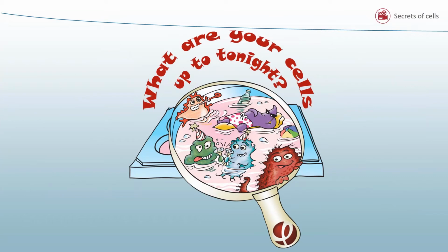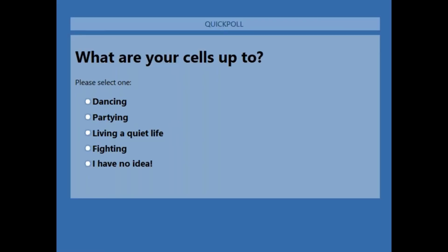So in today's webinar, I'm going to tell you about the label-free applications which can help you answer the question, what are your cells up to tonight? So let's start with a quick poll. Do you know what your cells are up to tonight?